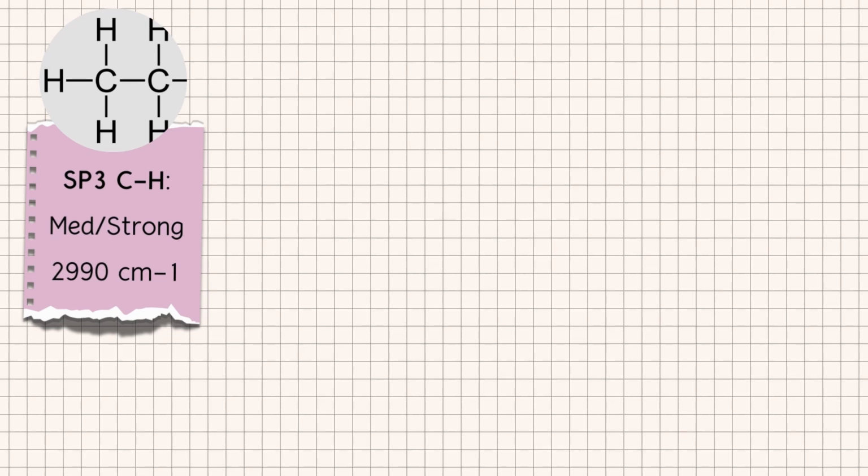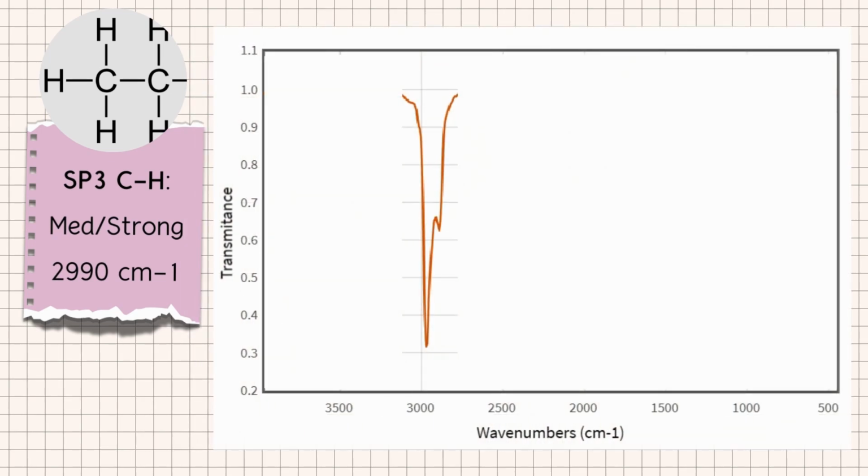All right, finally, we have the last kind of significant signal. It's not really a functional group again, but you may have noticed it in the various spectra I just went through, because once again, it's pretty common. Look at this spectrum. The peak is pretty strong here, and it is literally bordering 3000, so I kind of left it at 2990. This peak can be a little shorter or wider, but this is the general idea.